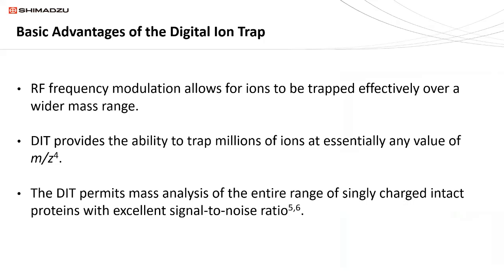Since we're talking about a MALDI, this is pretty critical, because when you're ionizing with a MALDI system, we use a matrix, and typically that's in high concentration. That can tend to suppress some of the signals you may want to analyze. By having the ability to remove the matrix ions that would suppress other signals, you're able to get better signal to noise.